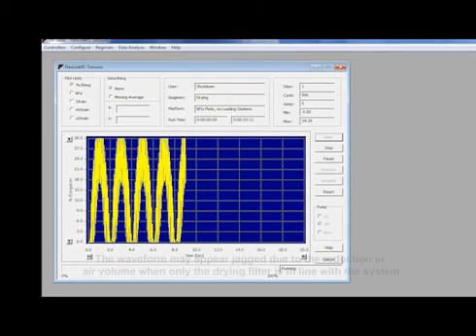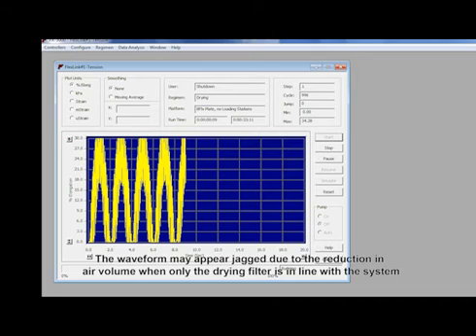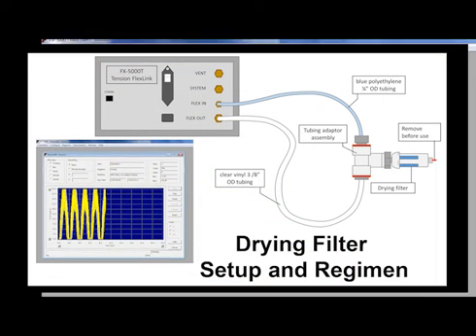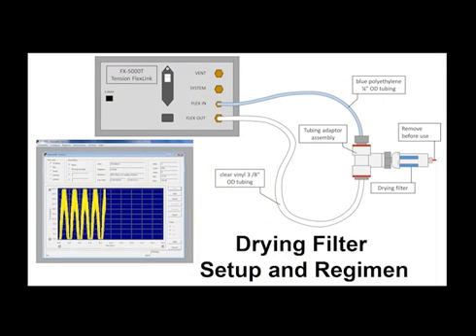A waveform will propagate across the graph in the control panel window of the FX5000 software. Your Drying Filter Regimen is now running.